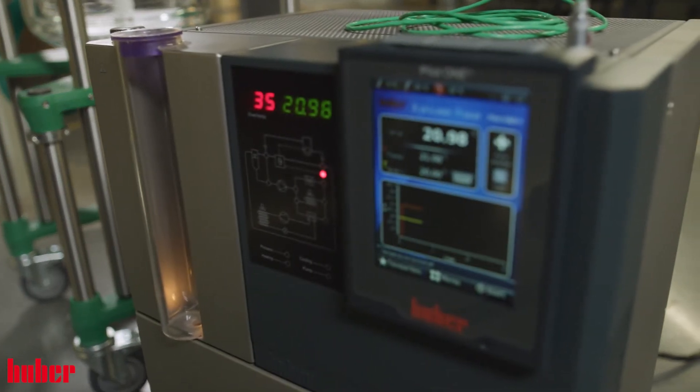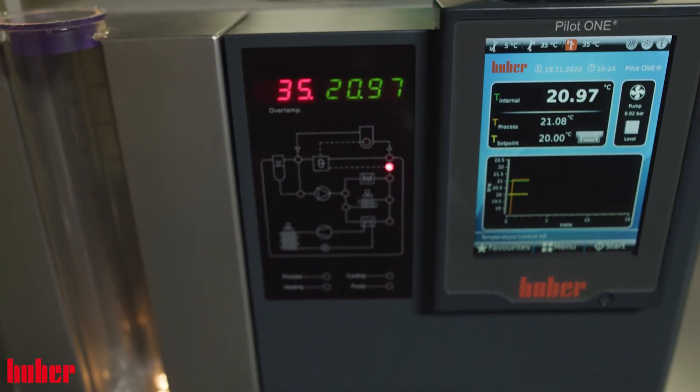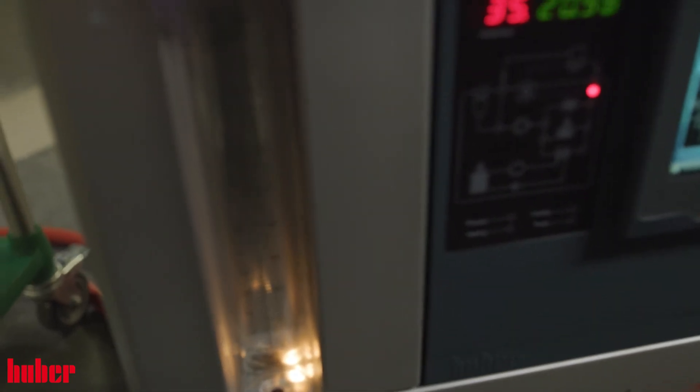With its three kilowatts of heating power and variable pressure pump, this unit is a great choice for a glass reactor application. The 405 has a temperature range of negative 45 Celsius to positive 250 Celsius. It also features M24 pump connections, which provide a great flow rate to the application while reducing any pressure increases.